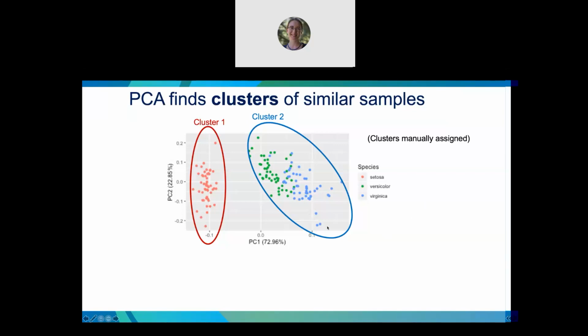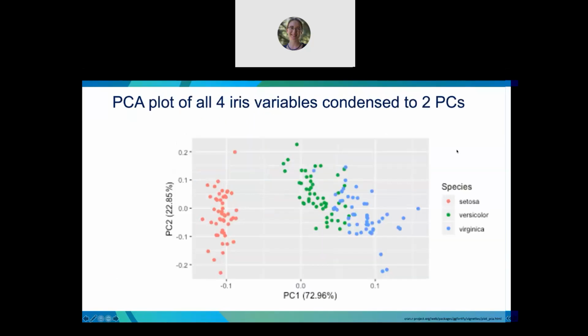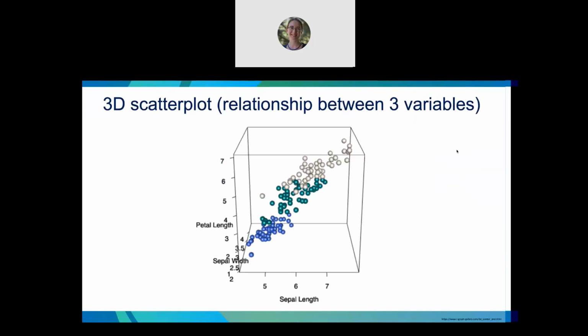Is your hand up, Dr. Heller? Yeah, I am Phil, and my hand is up. Can I just share a 1-minute intuitive description of PCA that I find really useful? Please. Can you go back? You've got a 3D plot of these points. Back one more, back one more. There we go.